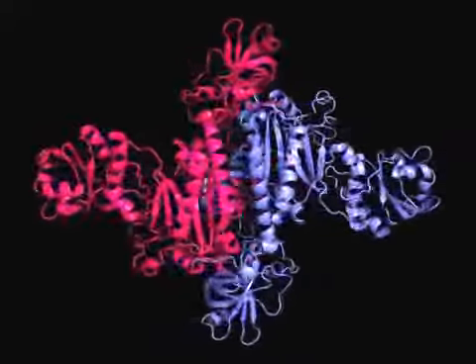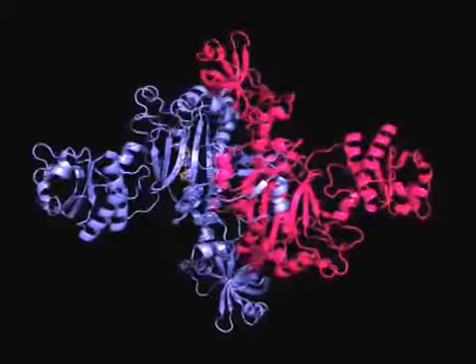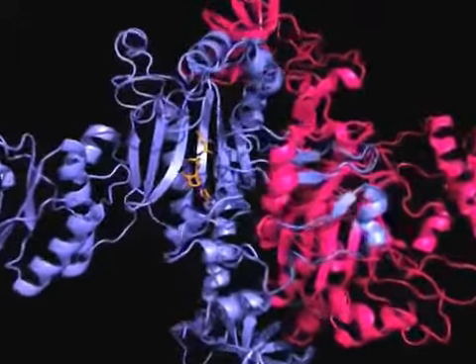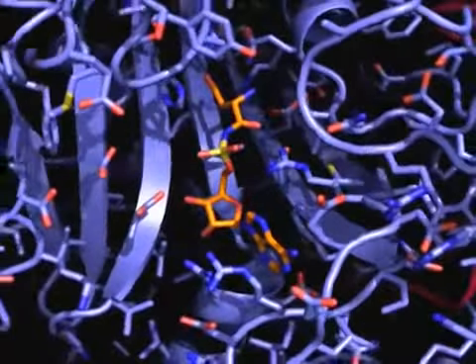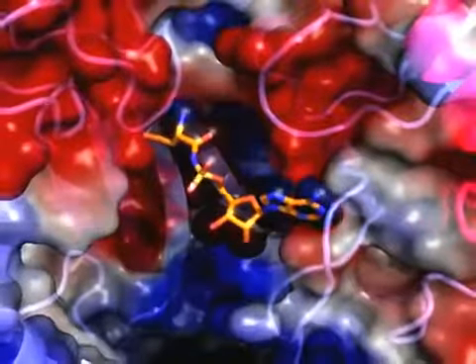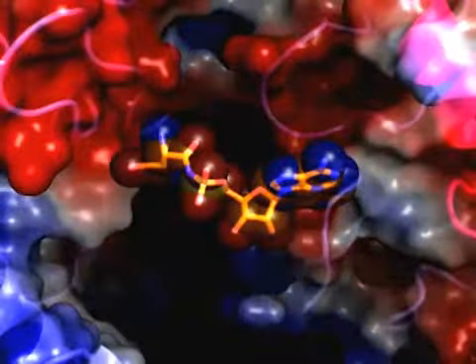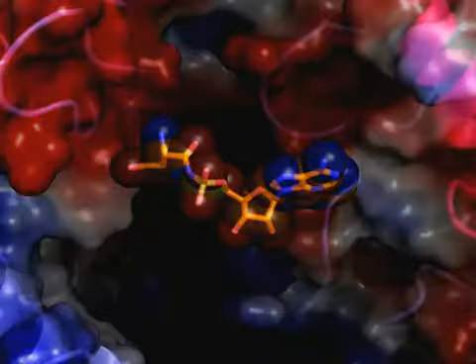For instance, they can reveal to us how an enzyme recognizes a smaller molecule to bring about a chemical reaction, or how an antibiotic molecule interacts with its cellular target. The type of structural study described in this film is used in fundamental science to understand the functioning of biological macromolecules, but this kind of study is also used in more applied areas to help develop active molecules which lead to the drugs of tomorrow.